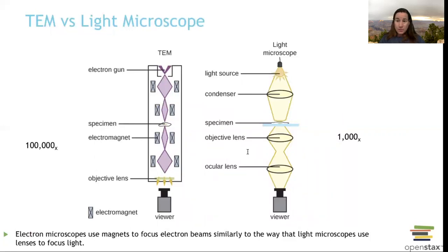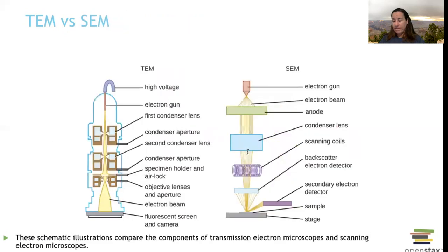The light microscopes, we said total magnification was 10 times the 100 on the oil immersion to give us a total of 1,000 times what you would see with the naked eye. Electron microscopes, again, they're using electrons with a higher energy. They get increased magnification, increased resolution. So they are now at 100,000 times. So they are seeing much smaller things on an electron microscope than a light microscope. TEMs versus SEMs.